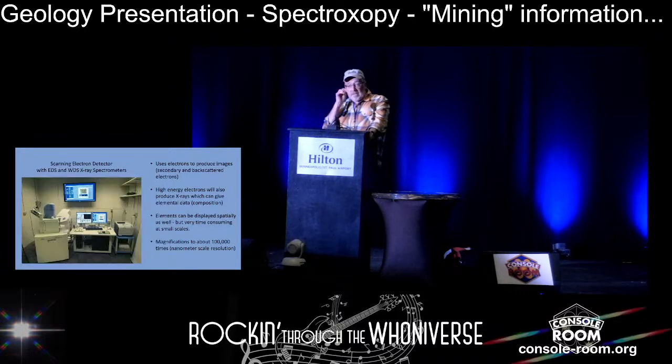So the most fun piece of equipment that we have is the scanning electron microscope. We got this through another NSF grant in 2010. $351,000 for this one. And it includes 2 X-ray detectors. You can see one off the left side of it. The big planar white thing is a wavelength spectrometer. And then 2 different computers. It's an expensive piece of equipment.